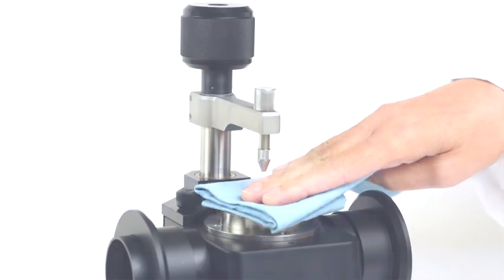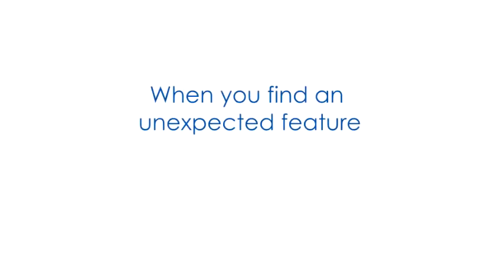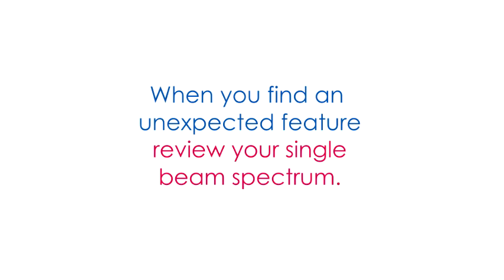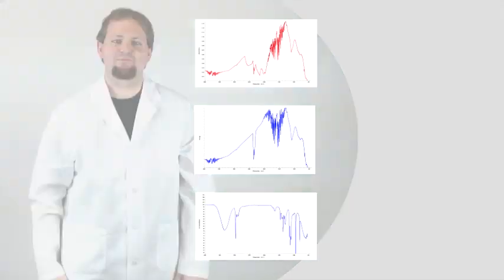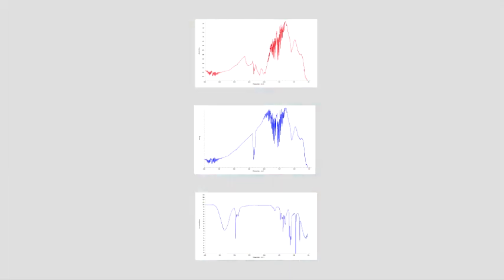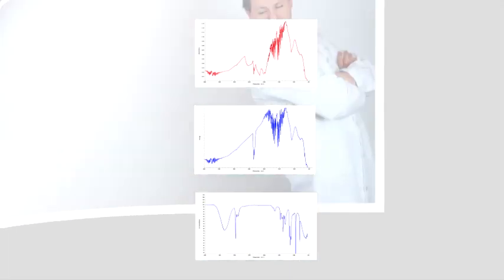When you find an unexpected feature in your spectrum, review your single beam spectrum. It's a good practice to save the background spectrum along with the sample spectrum. This feature may be selected in the FTIR software.